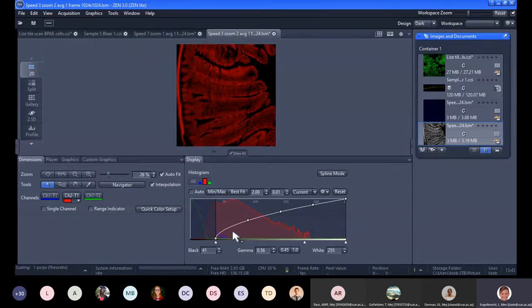Right, I see the time is almost finished. I wanted to quickly show you different displays. If you have a multicolor image, you can put them into three different colors, editing, of course, each one separately by itself. You can overlay. There's many, many different things. I just want to reduce that again.